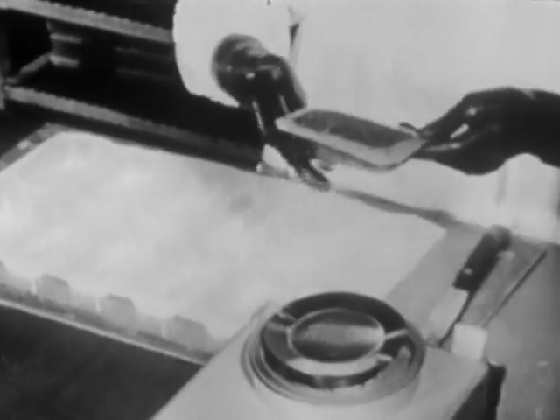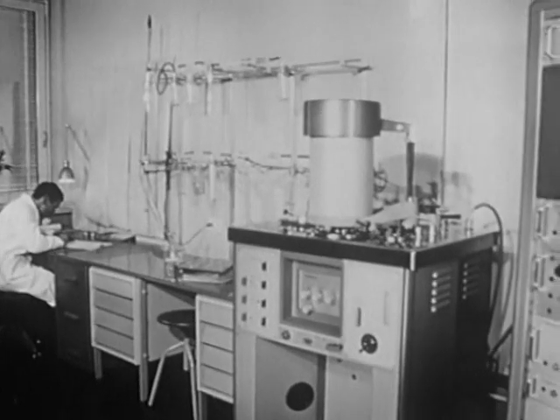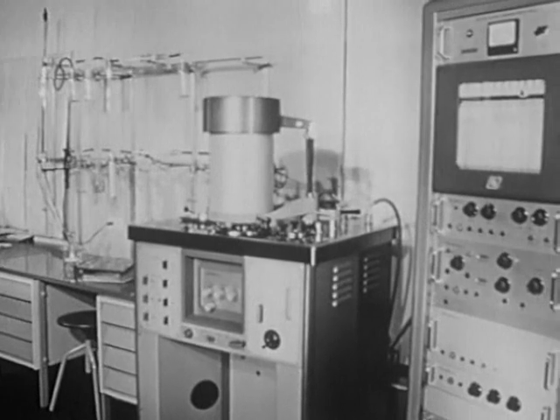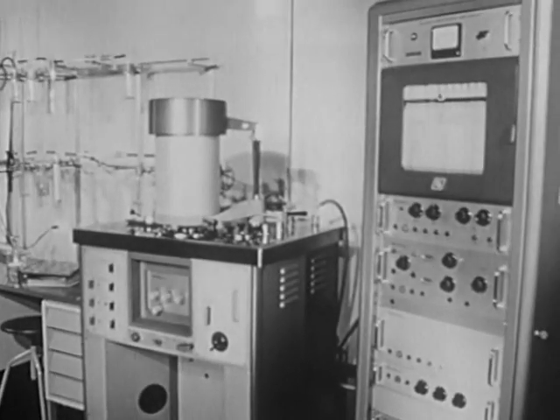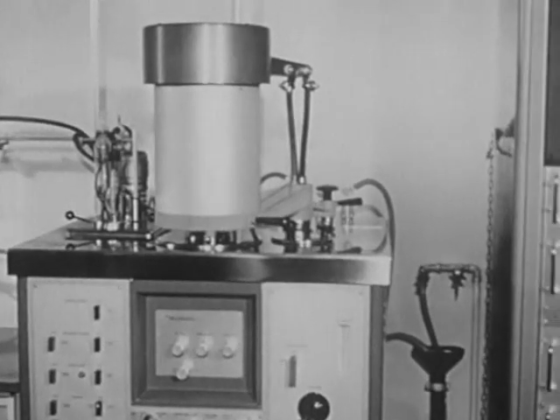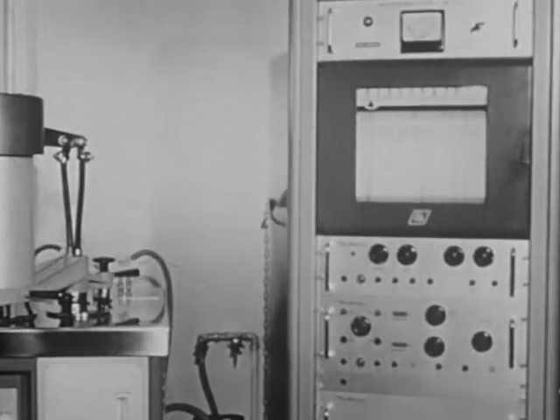NASA uses balances with an accuracy of measurement of 10 mg supplied by the Swiss company Mettler in Greifensee. Besides precision and analytical balances, other combined analytical instruments from the same company are also used in aerospace research—for example, the recording vacuum thermoanalyzer.